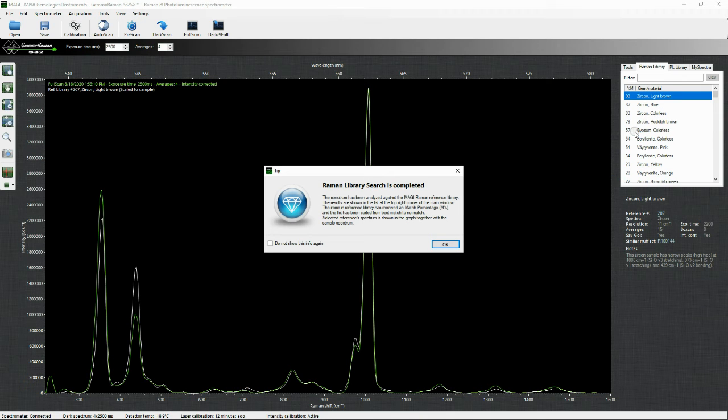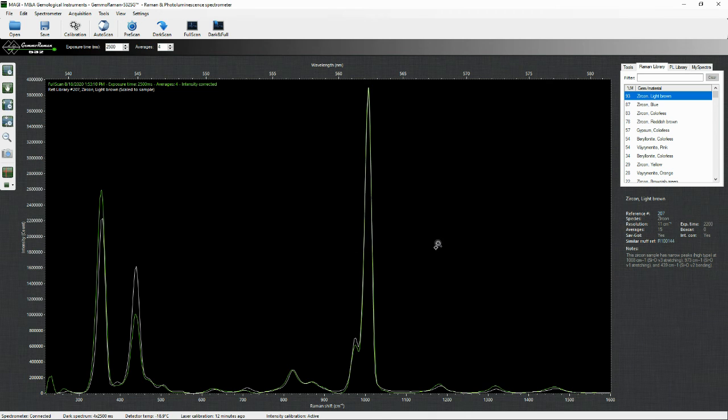In conclusion, the purpose of operating manually instead of using autoscan is essentially to save time in those cases where the operator already has a clue about the possible identification. There are several instances where a simple glance at the pre-scan result can solve the issue, so there will be no need to waste time on a complete scanning procedure. Practical examples. Let's see a couple of cases where the single pre-scan procedure can solve the issue.